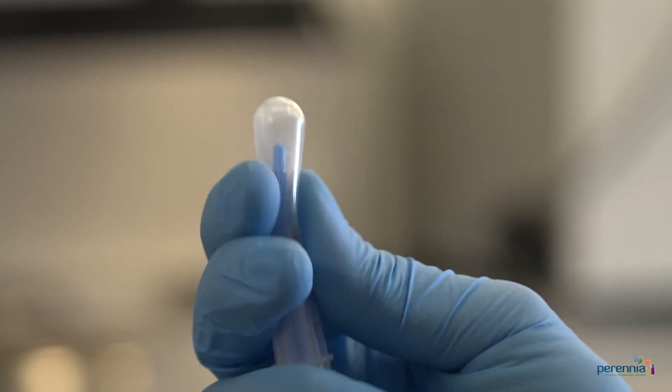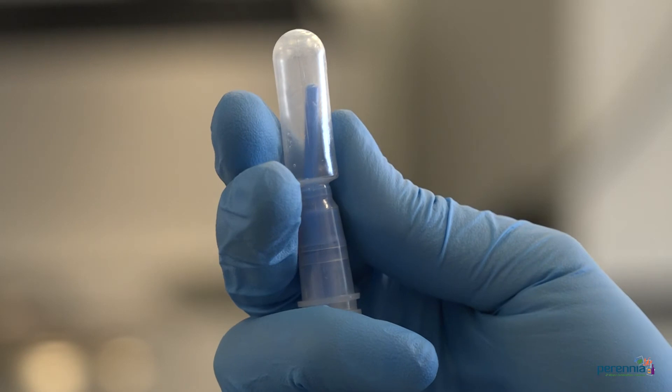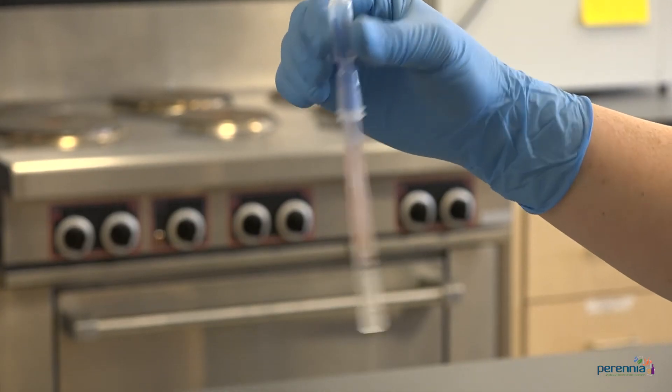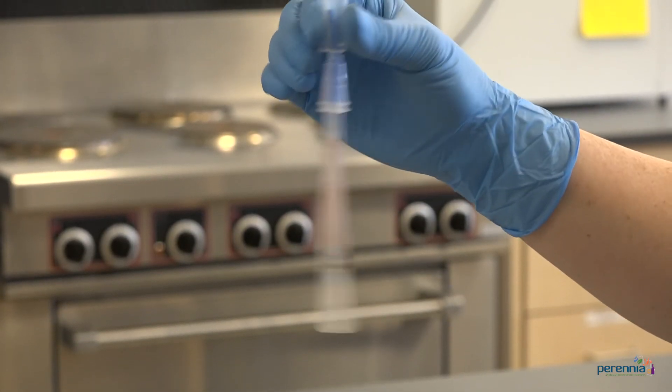Step number seven, squeeze bulb twice to move liquid into the tube. Step number eight, shake for five seconds.